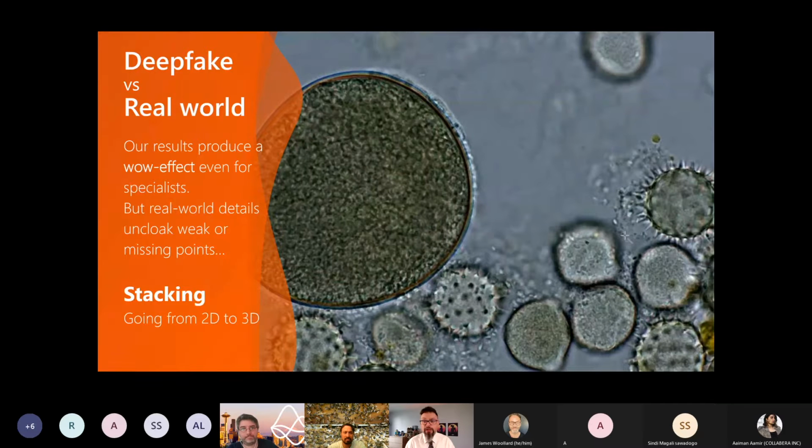And we are very happy about that because it's like a deep fake. We have trained an algorithm with fake images. And the first time, I don't know if you remember that, Kim, we showed the generated picture. So it wasn't a real microscope lamella, but it was a generated image. There was a kind of wow effect. Oh, where did you get that image? Do you know some bees or some laboratory technician? So there was a wow effect.